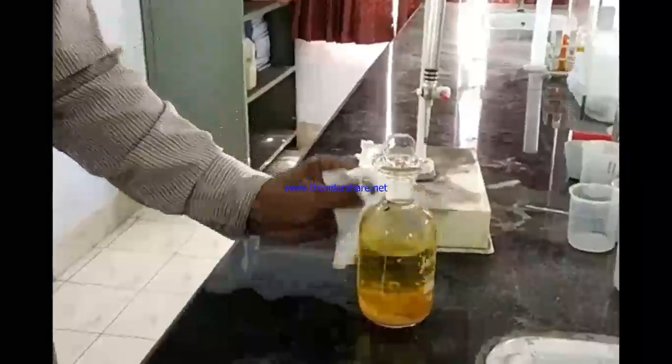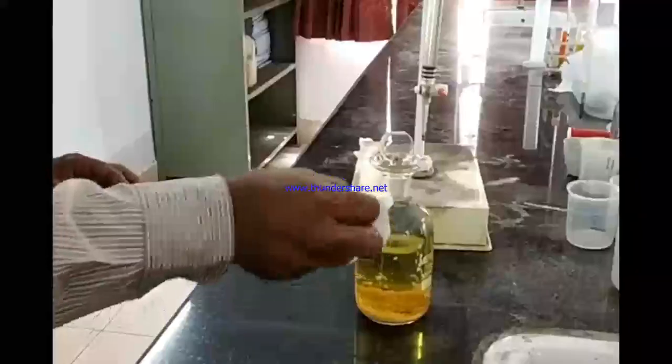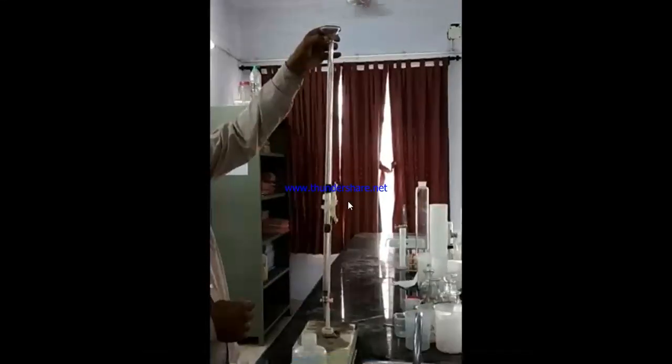Okay, a little bit of time it will take. It's a time taking process. DO determination, it's a time taking process. आप देखिए धीरे धीरे सब घुल रहा है. Okay, everything will get dissolved.